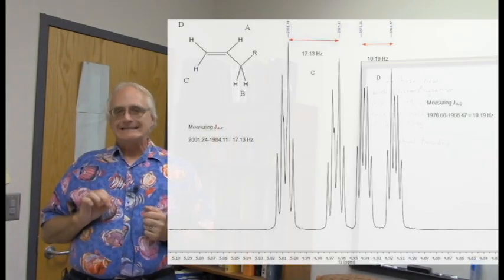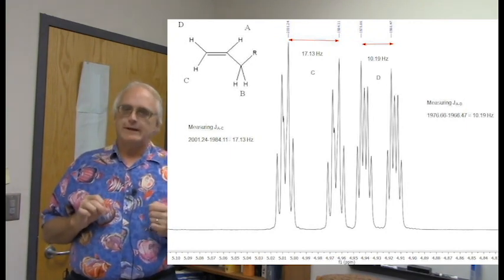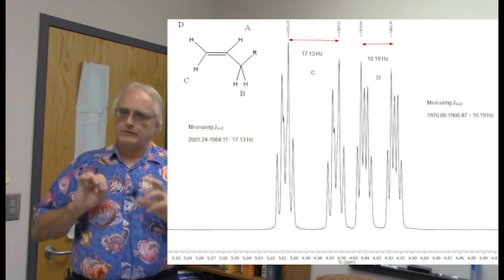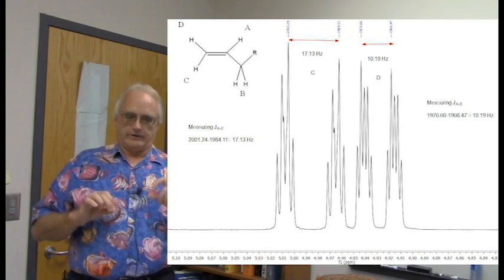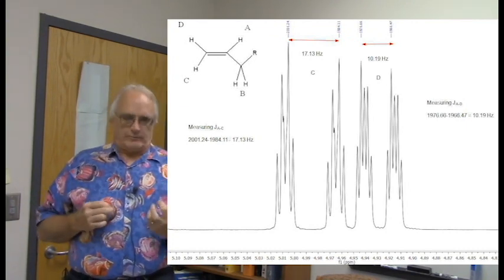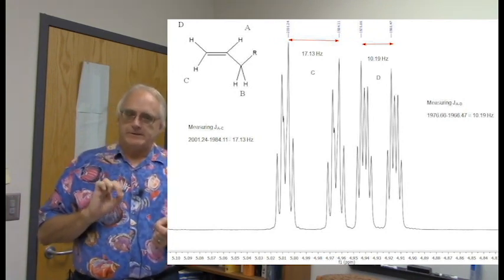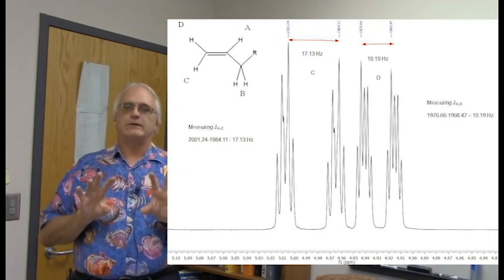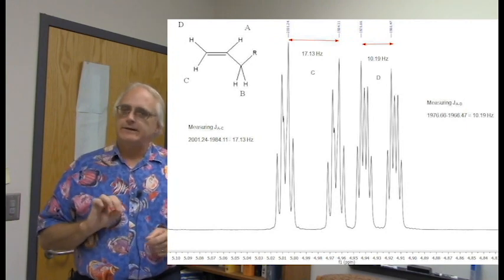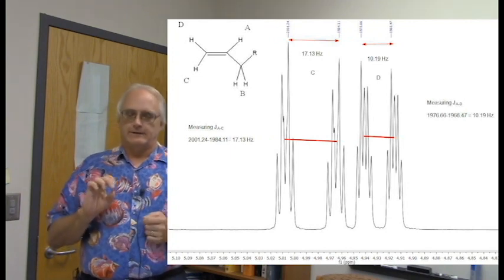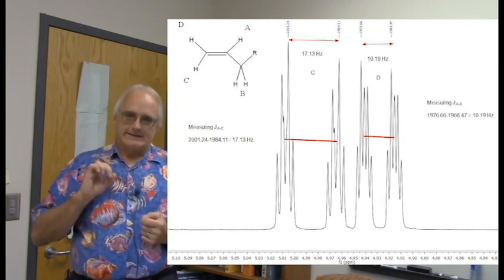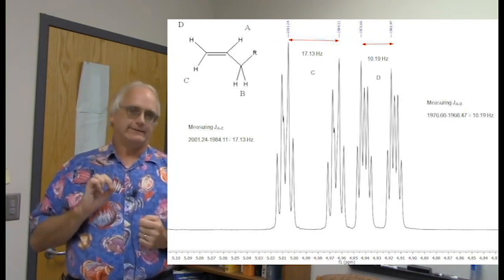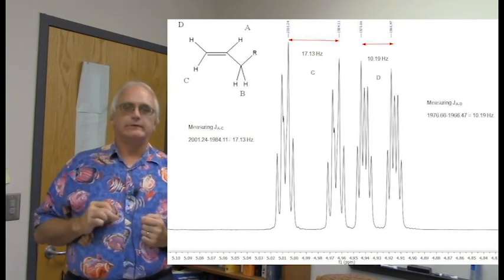And to do that, I am going to actually look at groups C and D up close first. So here they are. Now when you look at these, you can tell that they are closely related to each other. And in fact, someone if they looked at it real quick might go, oh look, four peaks, it must be a quartet. No, there is nothing about it. It is not a quartet here. We don't see the classic 1-3-3-1 patterning. Small peak, large, large, small peak or anything. Somebody might say, oh well it must be a doublet of doublets. Now, a doublet of doublets is a possibility, but be careful. A doublet of doublets would give the two outer, the separation between the outer peaks and the central peaks would have to be identical. Look at this thing carefully. You see different peak separations between these various peaks, or groups of peaks in here. This is not a doublet of doublets. What we are looking at here is actually the resonances or the peak positions of groups C and D. We are looking at a doublet for group C and a doublet for group D.